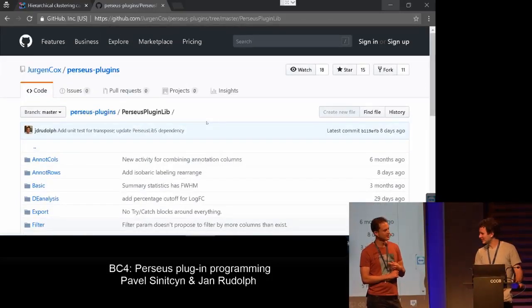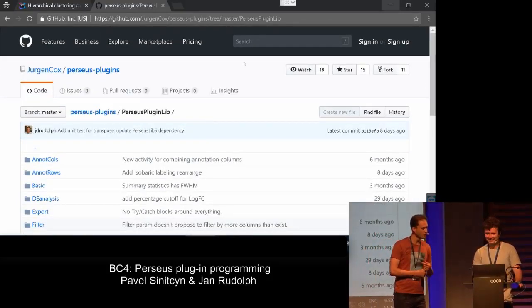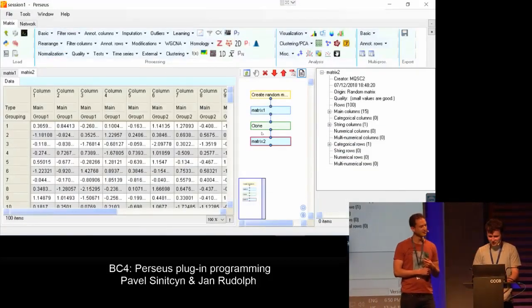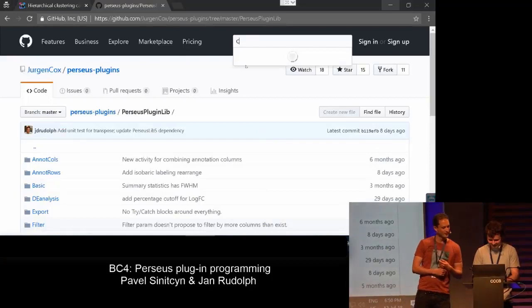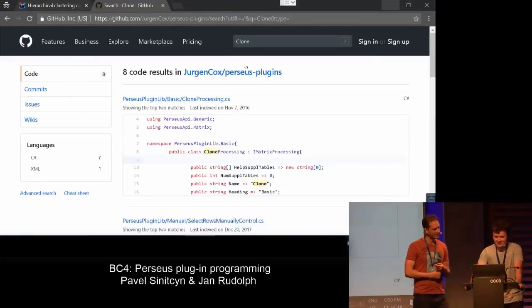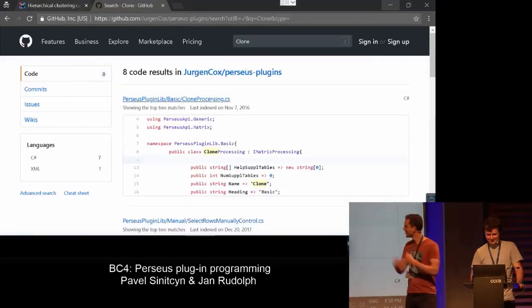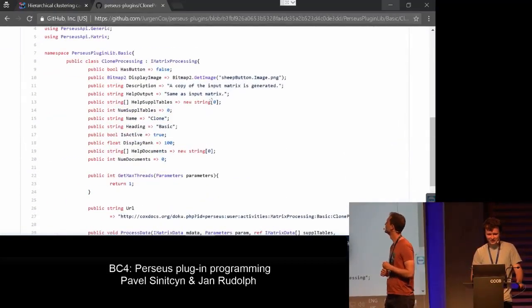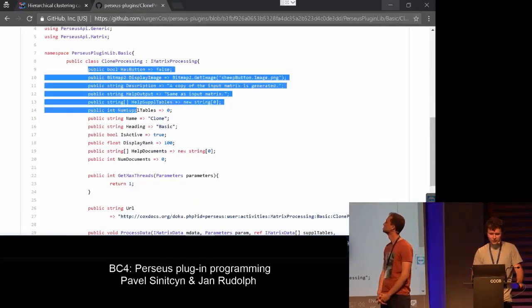You know, it's horrible. I tried. Yeah, but if you give it some cool keywords, it actually works really nice. I mean, okay, but just clone or ship? I don't know. I think if you say it right, it's the first hit, which doesn't happen very frequently. So you see, there's a clone processing, and there's a lot of code going on here.